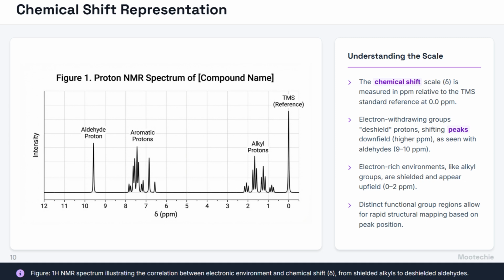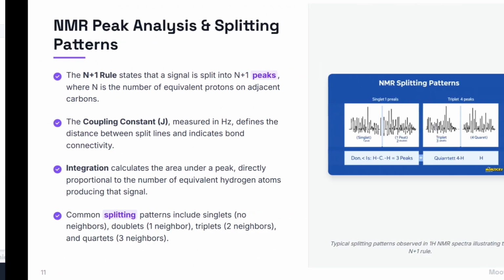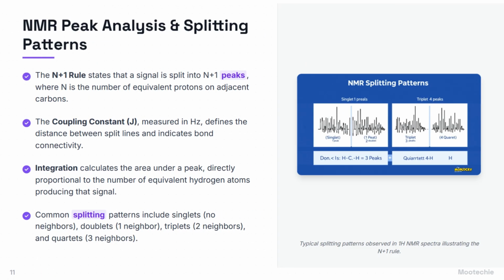The discussion note confirms that this figure illustrates the correlation between the electronic environment and the chemical shift, from shielded alkyls to de-shielded aldehydes. To finish our look at NMR, let's decode the conversation between protons. NMR peak analysis and splitting patterns.